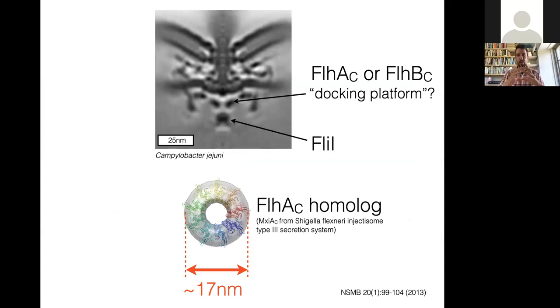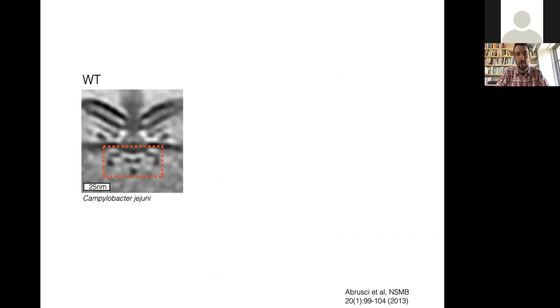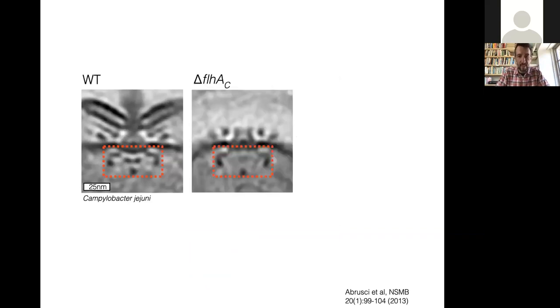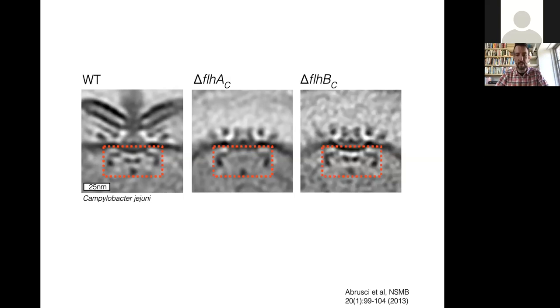This is a top view, there's a donut structure. It was very strongly suggested that this donut structure in our cryotomograms, this so-called docking platform, must be FlhA. To test that, we removed FlhA's cytoplasmic domain and what we saw was that indeed that donut exclusively disappeared within the area delimited by the red box. Everything outside didn't assemble because FlhA is an essential mechanistic component of the assembly process. What was significant was that this red box changed exclusively by loss of this toroidal density, compelling evidence that that toroid was FlhA.